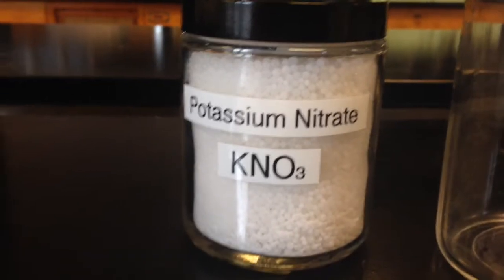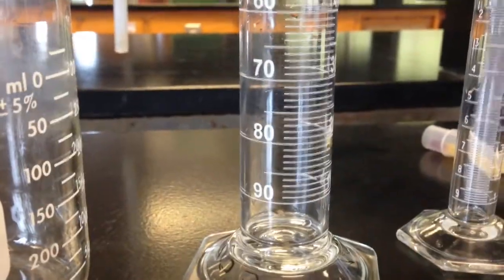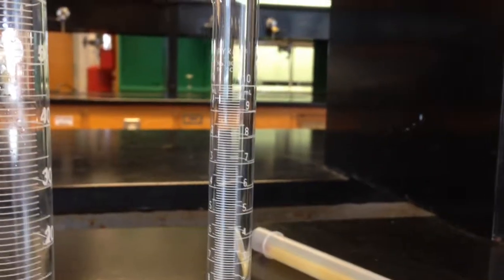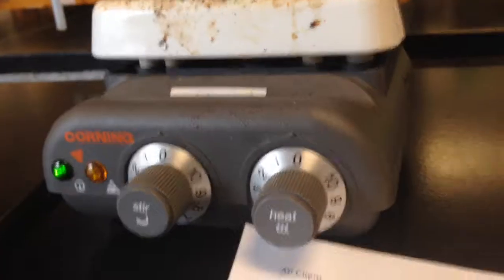You'll need potassium nitrate, 2 beakers, one for a hot bath and one for a cold bath, a 50 milliliter or 100 milliliter graduated cylinder. Here we're using a 100 milliliter, and here we have a 10 milliliter graduated cylinder. Also, you're going to need a thermometer, of course, for temperature recording, and probably most importantly, the hot plate.